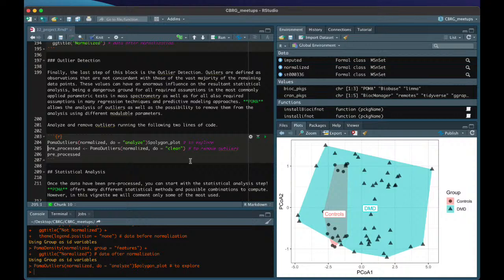Yeah, this plot tries to group samples by different groups in the covariate data, and then computes the distance from each sample to each group centroid. So we are computing the centroid of each group and then computing this distance to each group centroid.